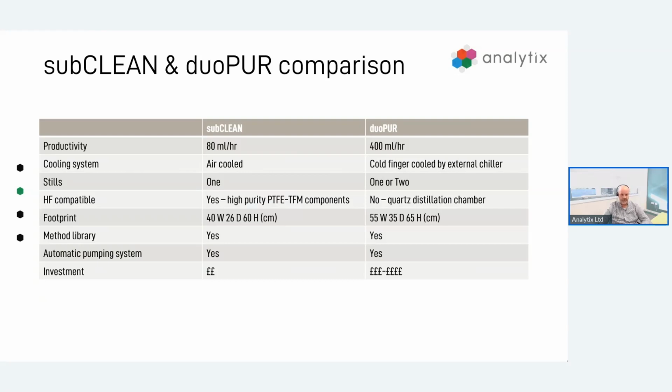It can often occur that if you haven't got clean microwave vessels, you will get heating of the Teflon itself, normally in the neck of the vessel. This is due to people not cleaning the vessels from run to run, where they're getting contamination of NOx getting trapped in the top of the Teflon. What this leads to is over temperature, over pressurization, and poor reproducibility of results. It also reduces the lifetime of the vessel significantly, so you will run into replacement costs a lot more if you're not cleaning your vessels or maintaining them properly.